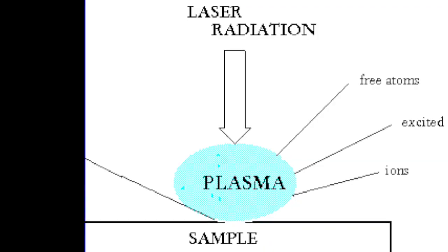The last factor is beam quality. The size of the beam must be controlled, along with its brightness and focusability, in order to properly deliver a high amount of energy to a very small region of material, often measured in micrometers.